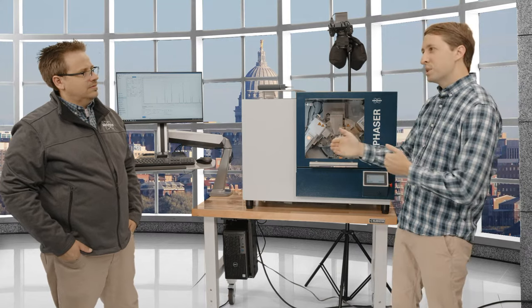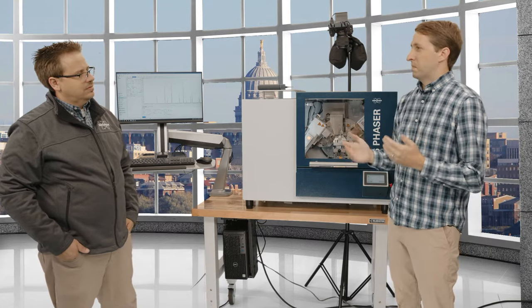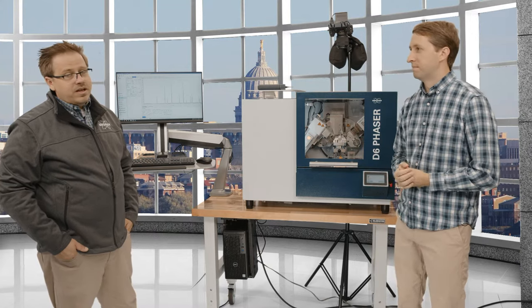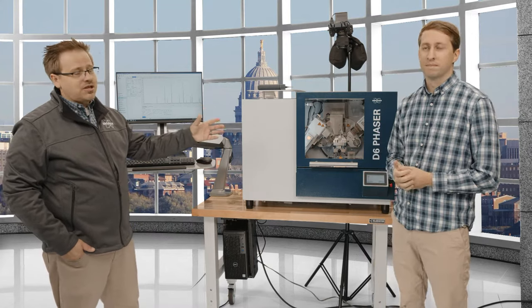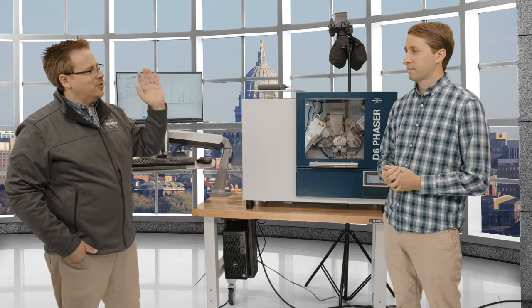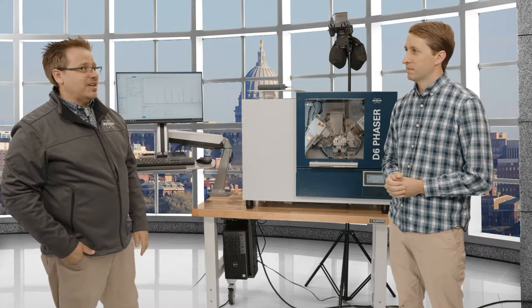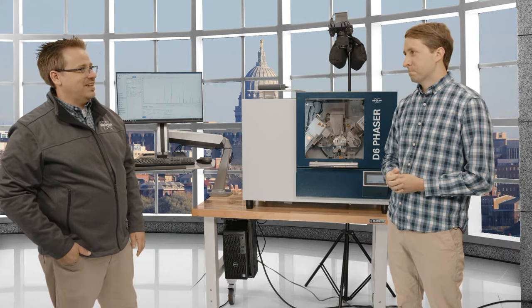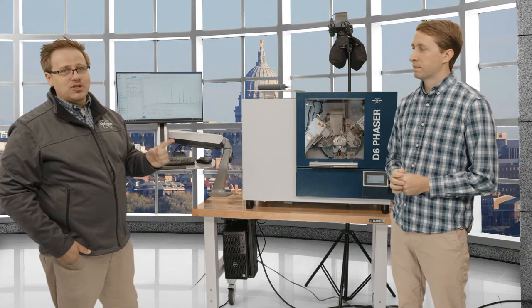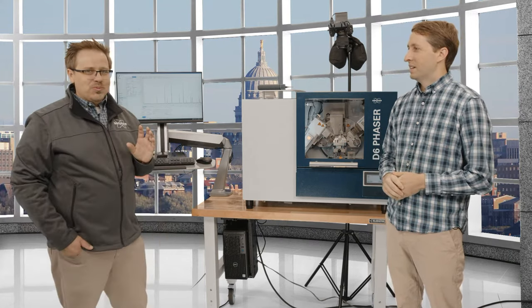Now this one is somewhere in between, right? It's running at either 600 watts or 1.2 kilowatts. So we don't know exactly how long the 1.2 will last. I would guess 10 years plus. And the thing about changing tubes: with an older machine, you might say, oh, I ran a tube for 20 years. The reality is, at 20 years, you weren't getting very good intensity. Right. Your intensity goes down, you start getting artifacts, and it's never a good thing if you change your tube and go, wow, my samples look different. That's right. So be a little proactive.